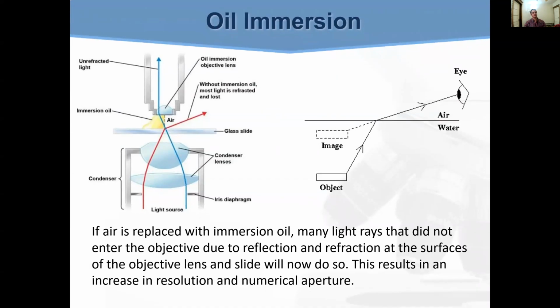So how do we deal with the problem of the refraction? Think about it like this. What happens when light moves from one medium to another? In this case, from your glass slide to the air and then to the lens. It's similar to when you're looking at a pool of water. When light moves from one media to another, its angle changes due to refraction.